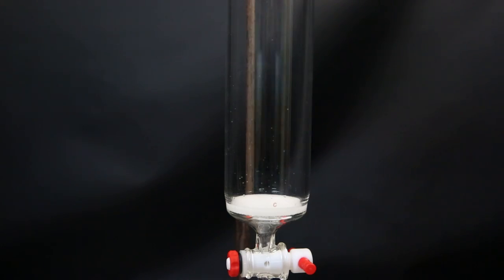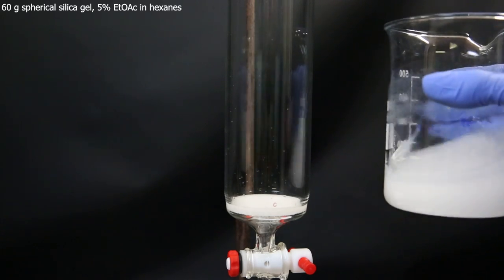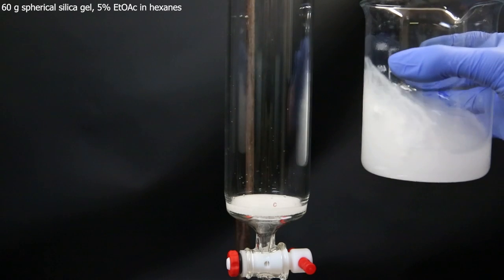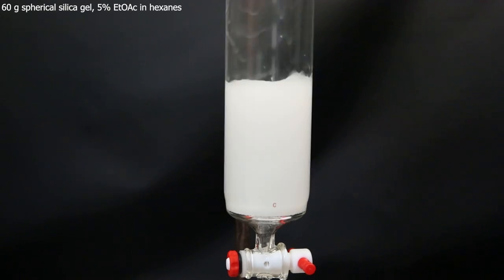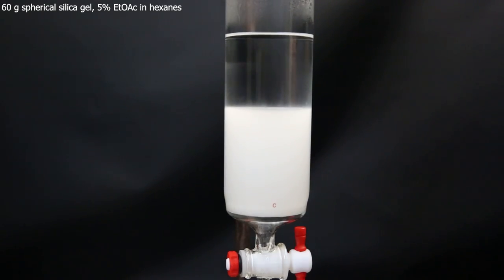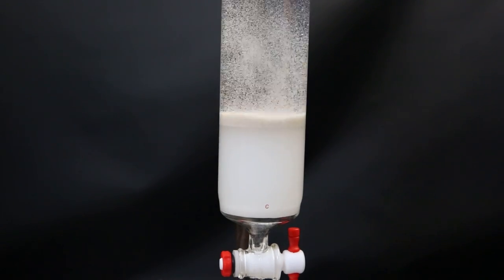Now to purify the product, I will do column chromatography. So I set up a column and add in a slurry of spherical silica gel in 5% ethyl acetate in hexanes. I wait for all of the silica gel to pack and then add a layer of sand on top.